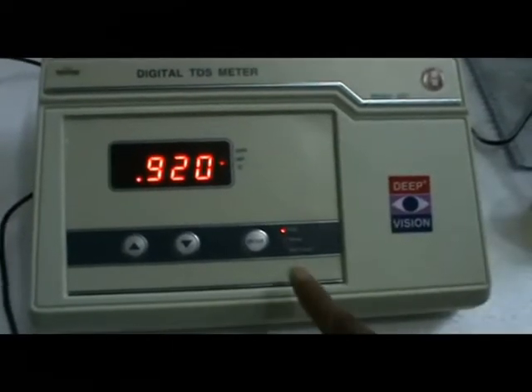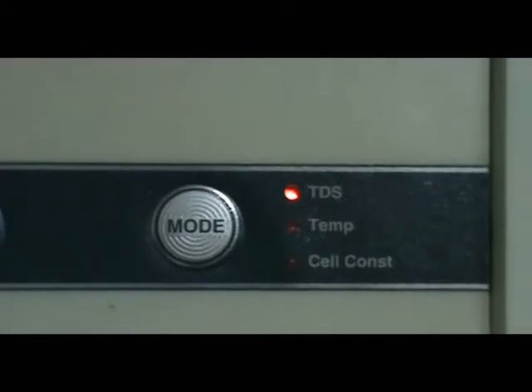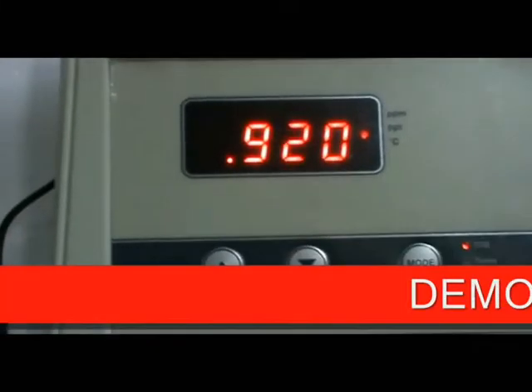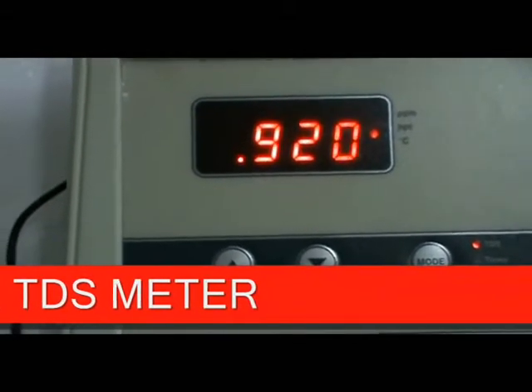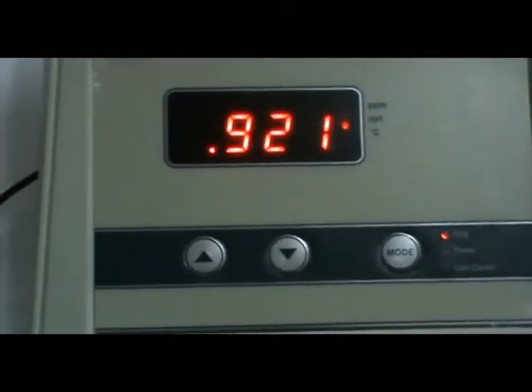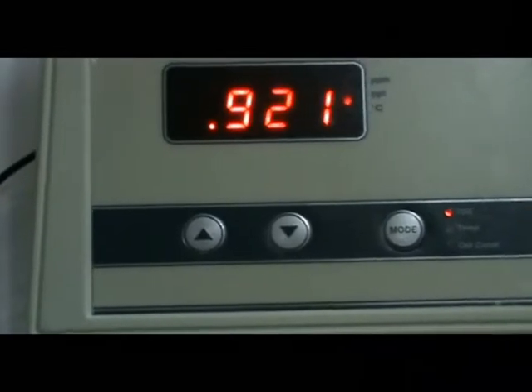Press the mode key and select TDS mode. Dip the electrode, then use the increase or decrease key to set the value. The instrument will automatically set the value. Thank you.